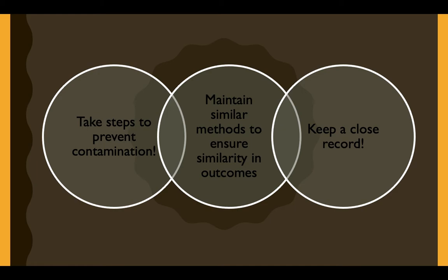Overall, you just should keep a close record of things in the lab. Labeling is also very, very important. So make sure that you can label them and distinguish them to prevent mixing them up.